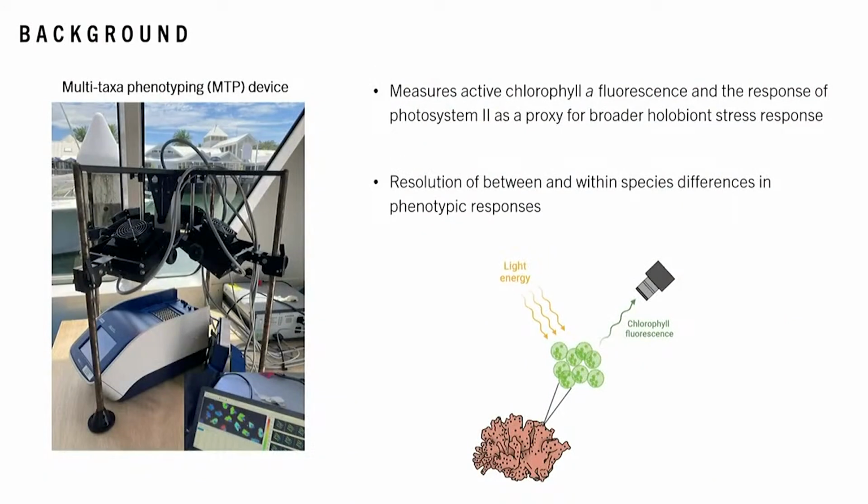Now, other phenotyping devices, such as CBAS, have successfully resolved both between and within species differences in coral phenotypes using this technique. Therefore, that's really demonstrating its value for restoration purposes. So we wanted to test the ability of the MTP device to do this, but particularly so in the field where it would be applicable to reef stakeholders.